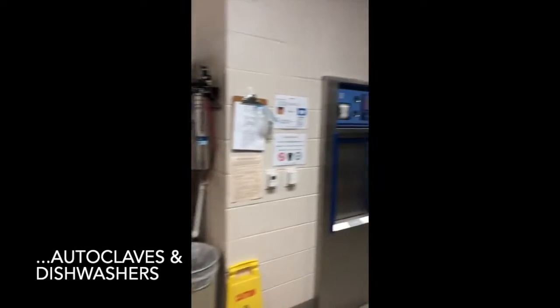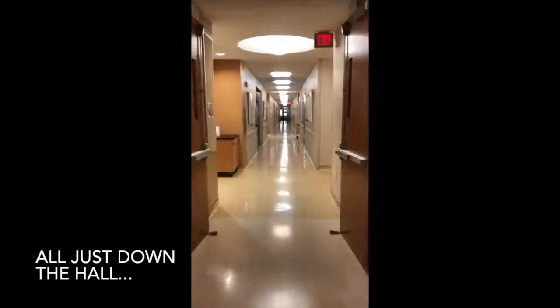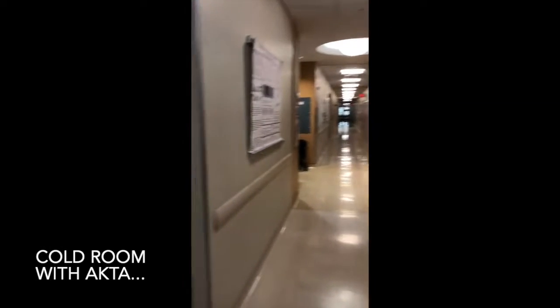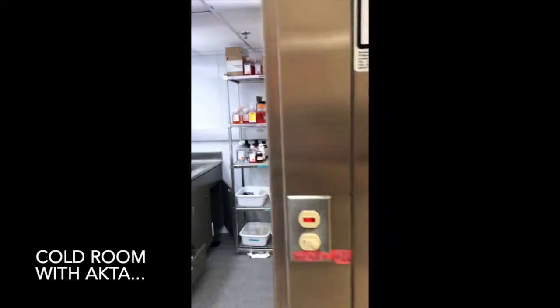Now this isn't too glamorous across the hall, but we do have access to several autoclaves and dishwashing facilities. As we zip back down the hall towards our labs, we also have access to a cold room.